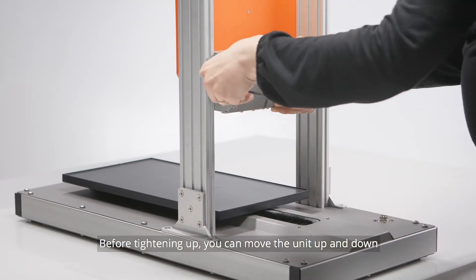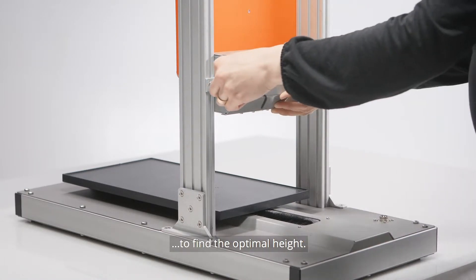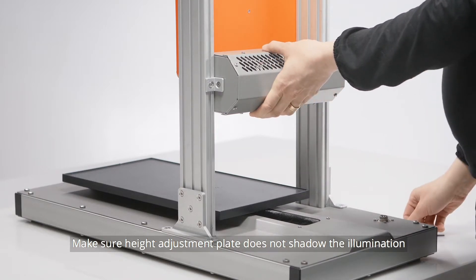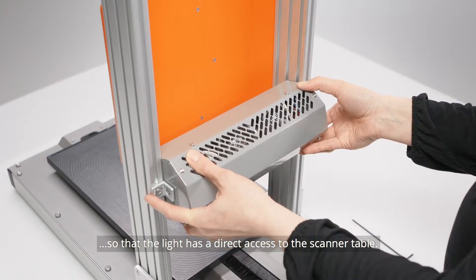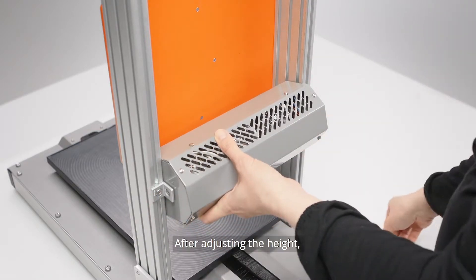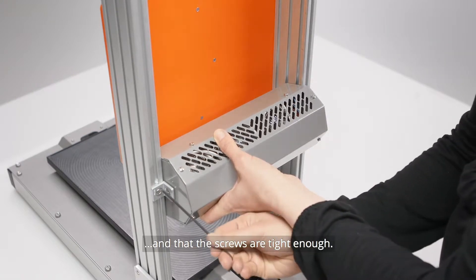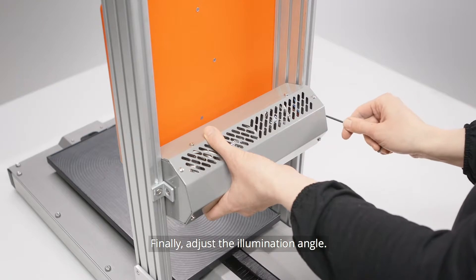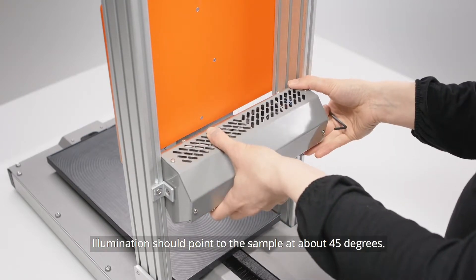Before tightening up the screws, you can move the illumination unit up and down to find the optimal height. Make sure the scanner height adjustment plate does not shadow the illumination so that the light has direct access to the scanner table. After adjusting the height, make sure the unit is level and that the screws are tight enough. Finally, adjust the illumination angle. The illumination should point to the sample at about 45 degrees.